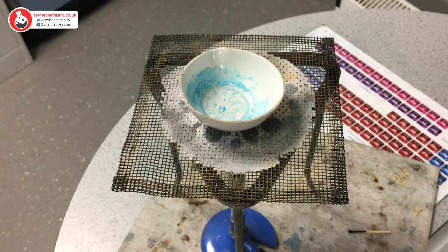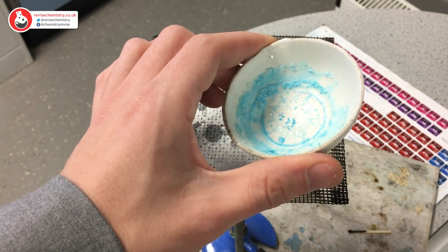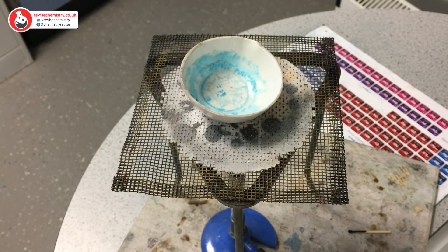So it's morning time. I've just arrived and we can see that we have formed some lovely blue copper sulphate crystals. The next step would be to take these crystals and dry them because they are still slightly wet, but essentially we have now completed this practical.